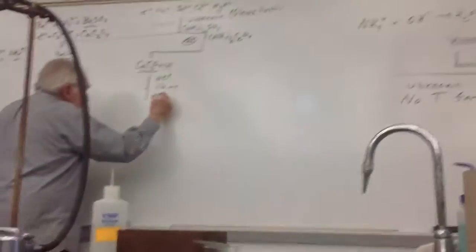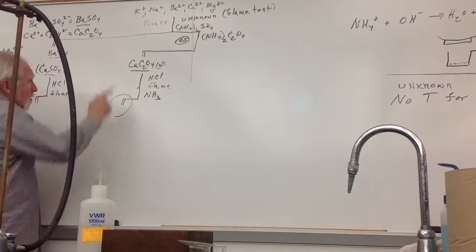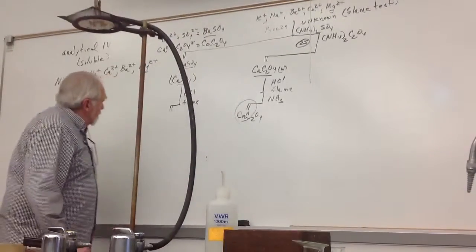And there's your reference precipitate. All you did was regenerate the calcium oxalate. Got rid of the H+. Dissolving calcium oxalate.